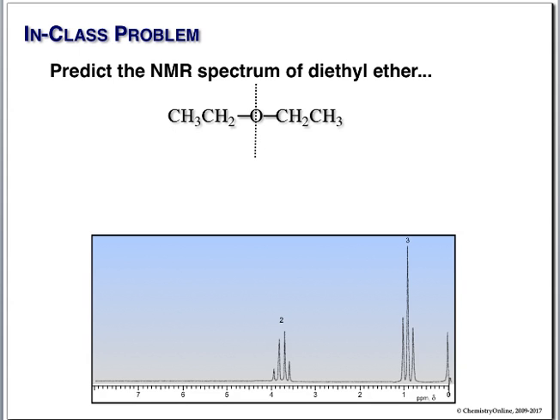Well, gee, there's a lot of peaks there, isn't there? This is splitting in proton NMR. Now, it might make you nuts, but this is extremely useful. This is split into a quartet. This is a triplet. The relative areas are 3 and 2. Our chemical shift, this is around 1-ish, a little less.